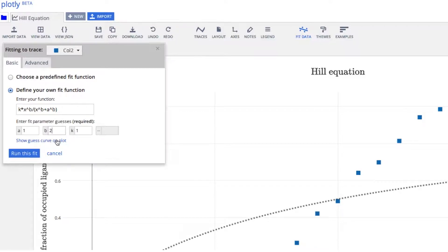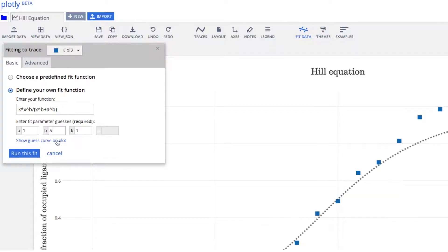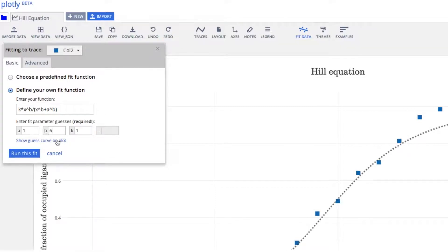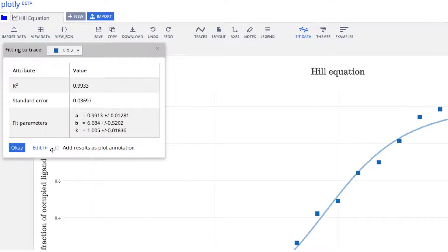As you edit the conditions, you can see what the curve will look like. When you get pretty close to what you think the fit will look like, run the fit. The actual parameters will appear in this pane, and you can add the equation to the plot itself.